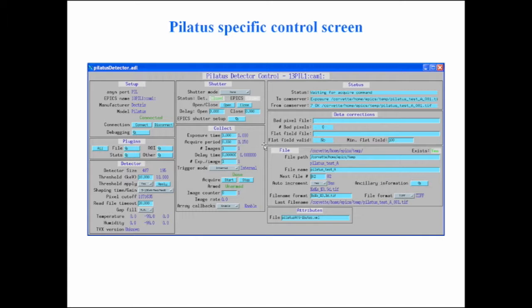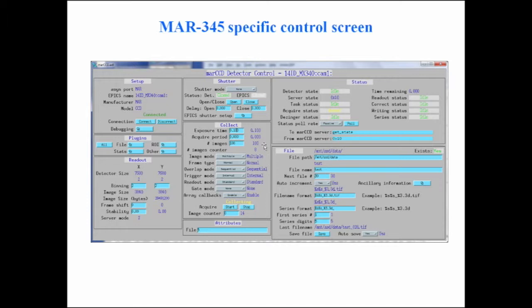This is also where you control where CamServer — the Pilatus vendor software — will save images, and where area detector will read those images back. If the area detector IOC and CamServer are running on the same computer, there's no problem with the path. But if they're on different machines, you have to use soft links or similar tricks so the path as seen by area detector matches the path seen by CamServer.